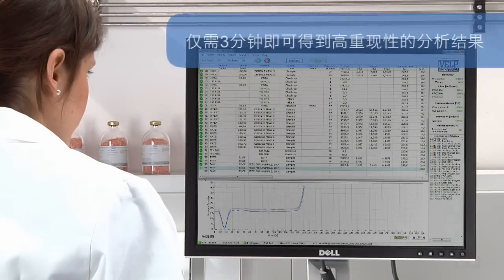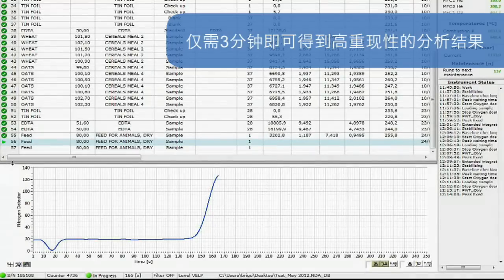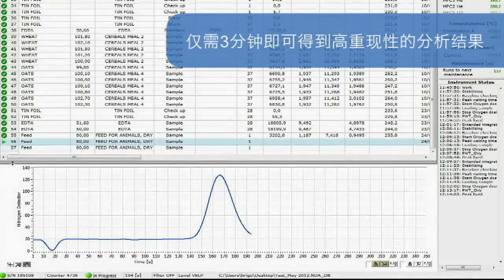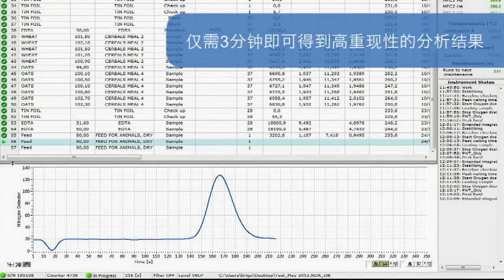The analysis time starts from 3 minutes offering repeatable and reproducible analytical results on several types of samples with no matrix effect in the determination of nitrogen.